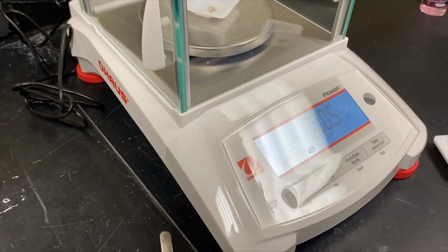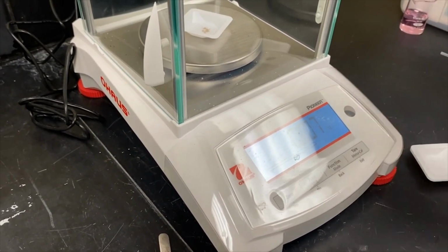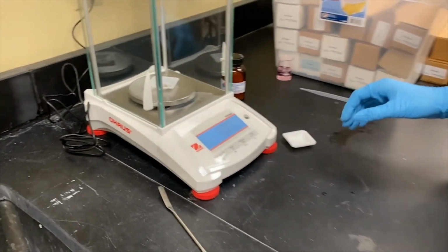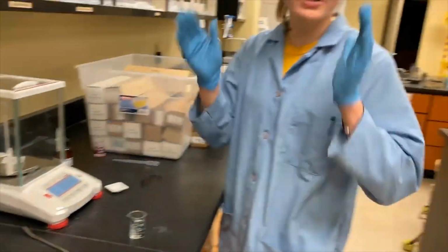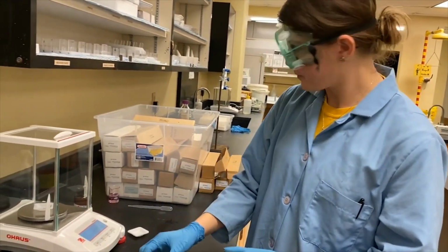So we have 0.005 grams, 0.06 now, and it's okay that I've overshot a little bit because I'm actually not going to put this one in the solution. I'm going to put this in our tap water here.